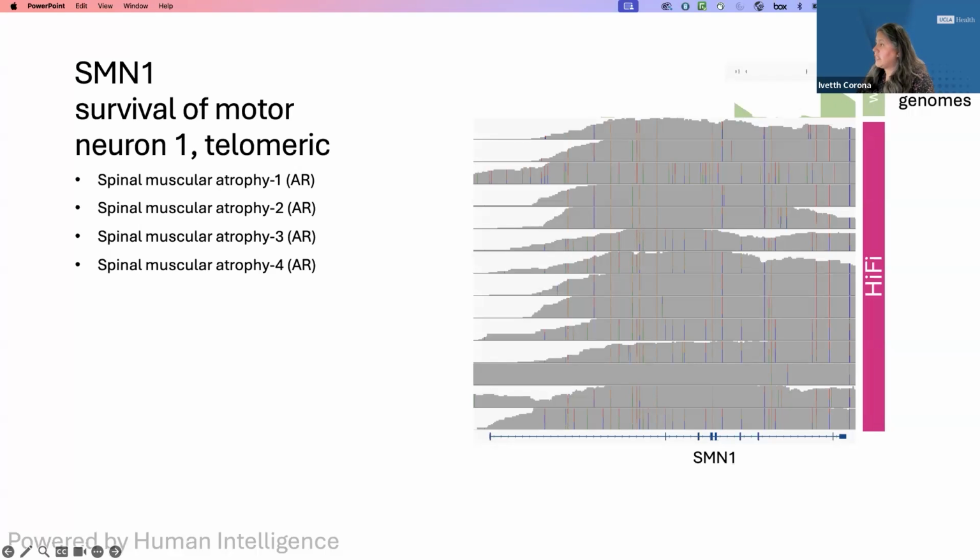But you also have this other track that I hope you can see. You don't have to look at the detail, just look at that. This shows the variants that are annotated in gnomAD. So these variants fall directly in the regions that were covered by the genomes. But the rest of the gene is not covered by the genomes in gnomAD, and also you don't have information on variants.